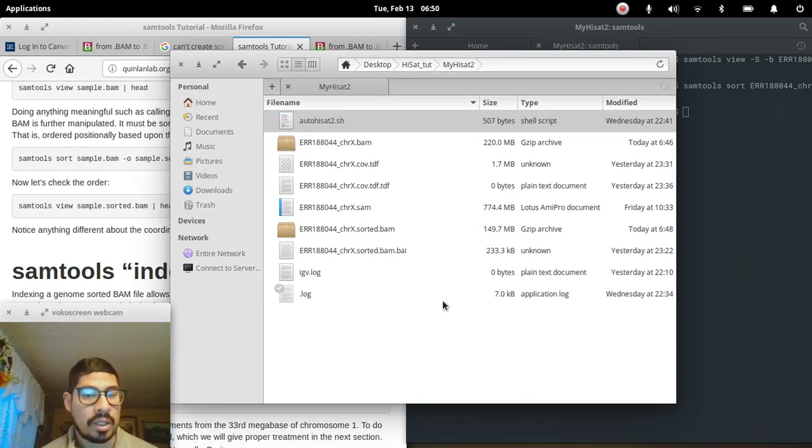we also have to map where our actual genome is. So we're going to be inputting those 3 files into IGVtools, and it's actually going to convert those 3 together into our TDF, so that when we call the TDF, it's going to already have everything it needs: the BAM file, our sorted BAM file of course, our BAI file, which will tell it where is what, and then the genome as a reference.